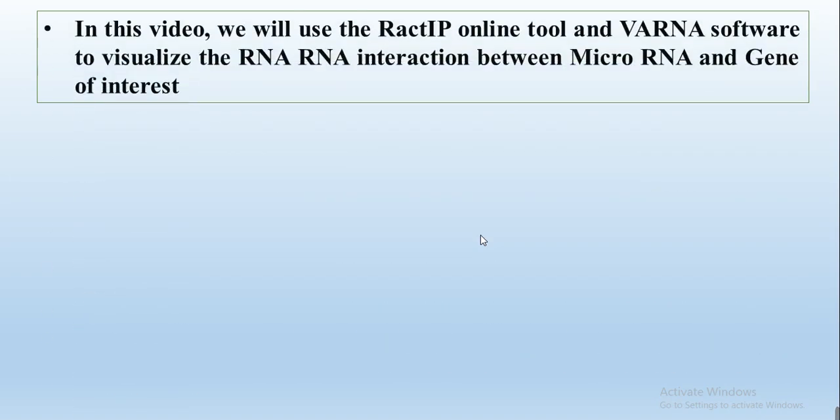In this video, we will use the RactIP online tool and VARNA software to visualize the RNA-RNA interaction between the microRNA and our gene of interest. The link to the RactIP online tool is also available in the video description, so you can follow that.